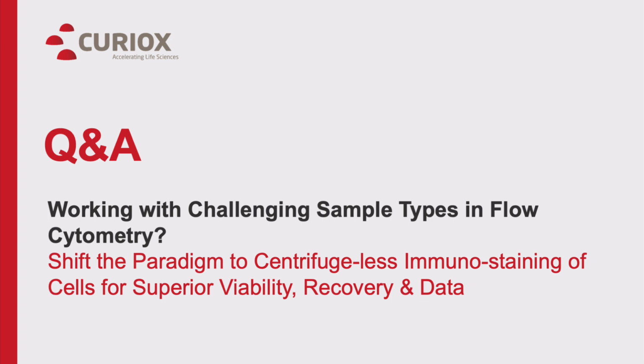So cycles can be repeated for anywhere between 2 and 20 times. They generally last anywhere from 2 to 5 minutes, and you can adjust the flow rates from anywhere from 5 to 20 microliters per second, if that helps.